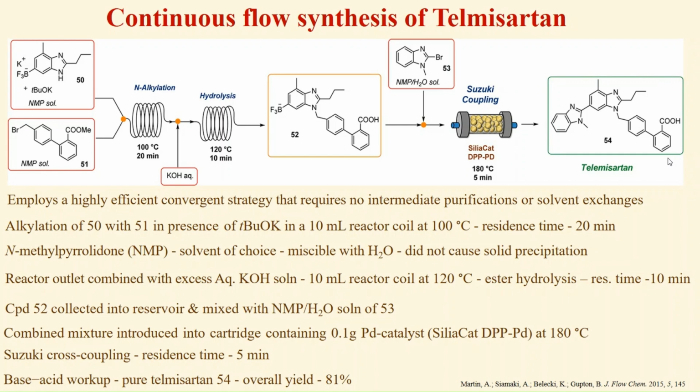The continuous flow system has also been utilized for the synthesis of enantiomerically pure compounds by stereoselective synthesis. That will be the subject of discussion for the coming presentation.